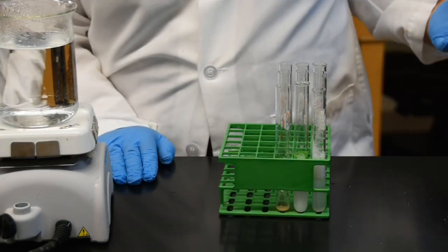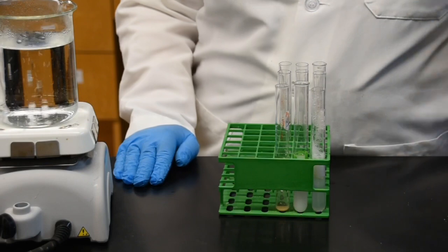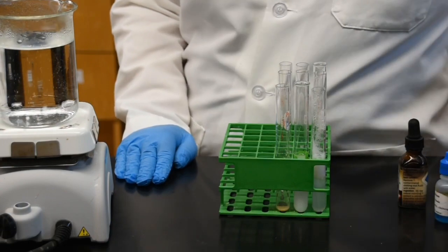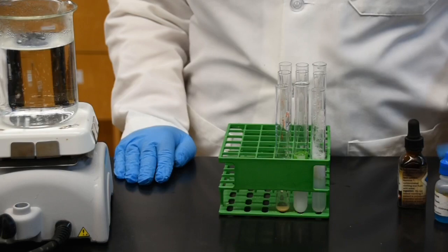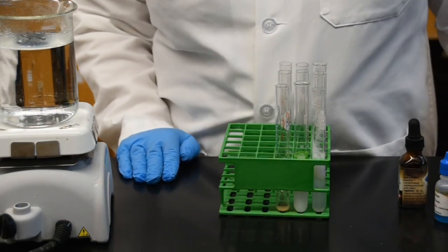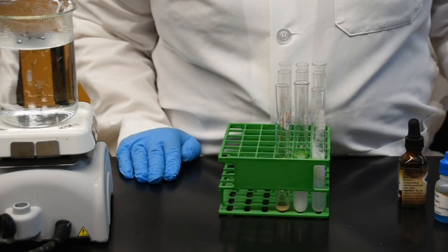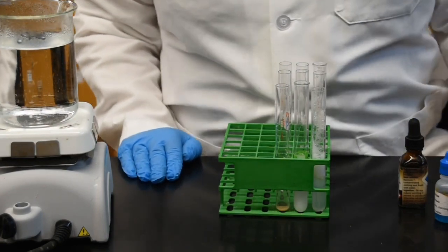Now, before we get started, we need to figure out how we're actually running this experiment. For us to be able to understand what each of our food samples contains, we're going to use what we identify as indicators. Right here I have 3 different types of indicators. Indicators, simply put, are solutions that change color in the presence of a very specific molecule. Otherwise, the color stays as the original color.